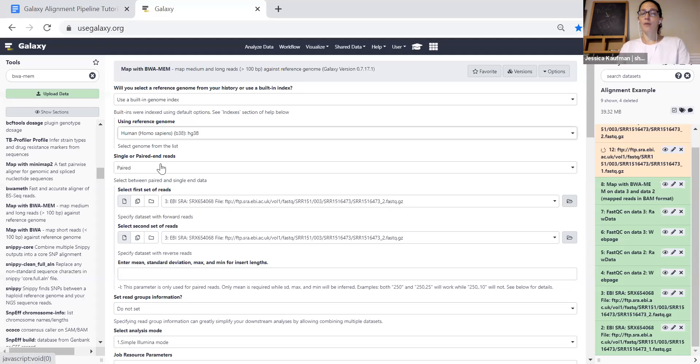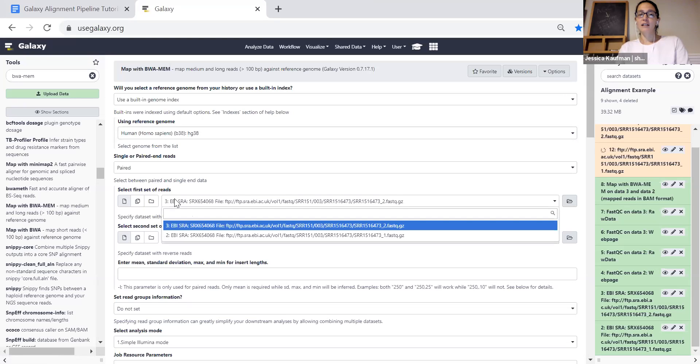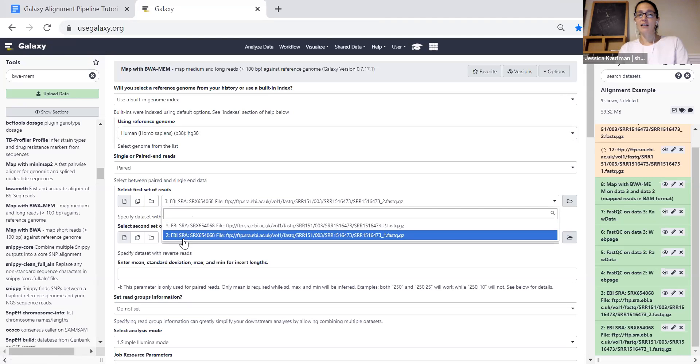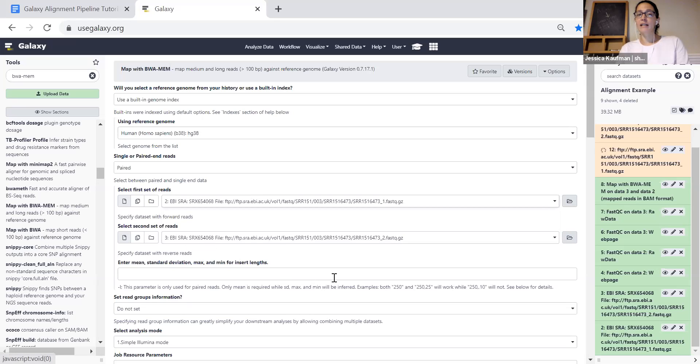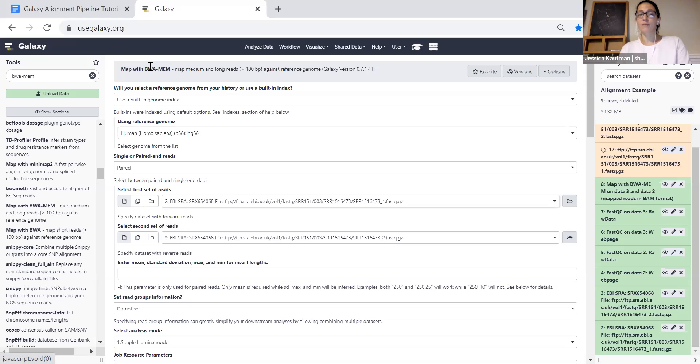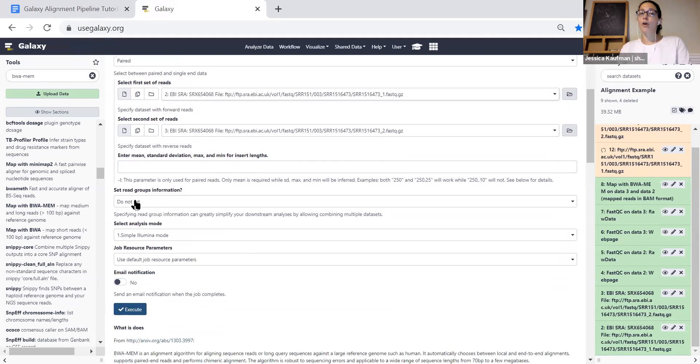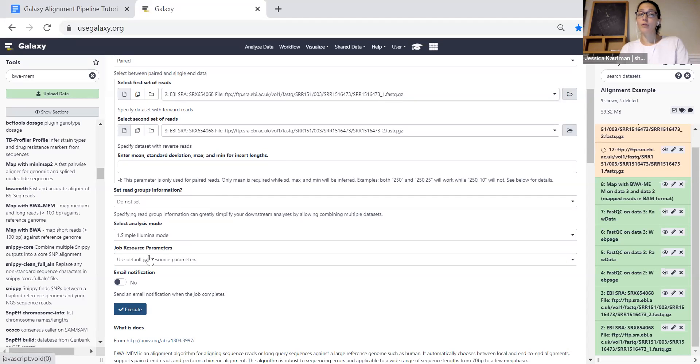We have a paired end experiment and we want to select the file that ends underscore one for the first read and the file that ends underscore two for the second read. Once we've made those three changes, we're going to run the tool on simple Illumina mode with default settings and click execute.